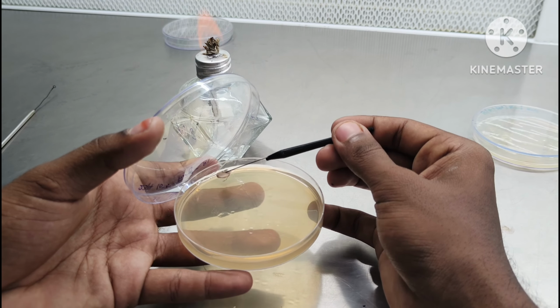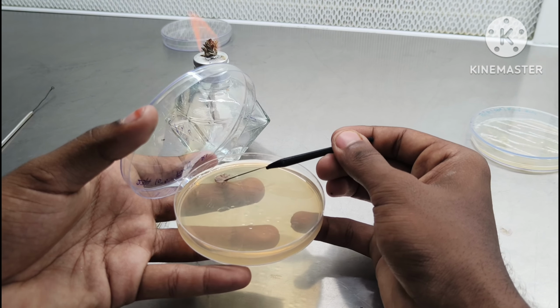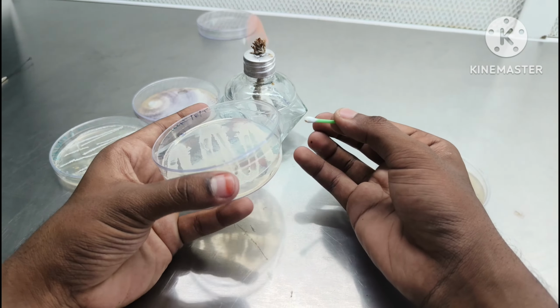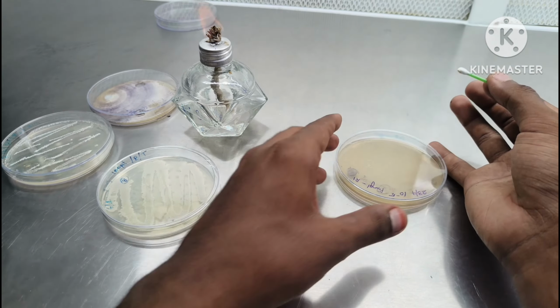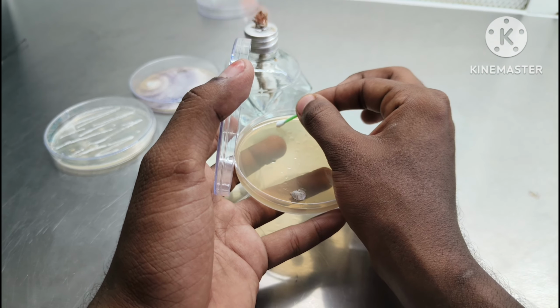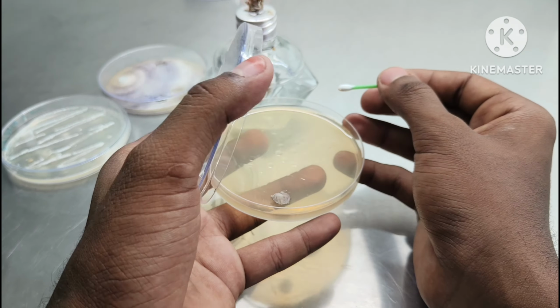and was placed near the peripheral end of the sterile disposable Petri plate. Bacterial isolate was taken out using a sterile bud and was then streaked against pathogen near the peripheral end of the sterile disposable Petri plate.